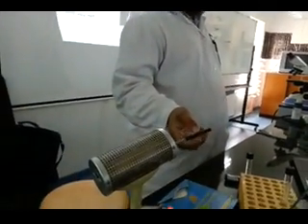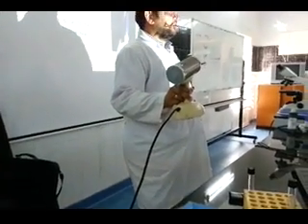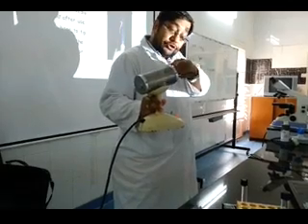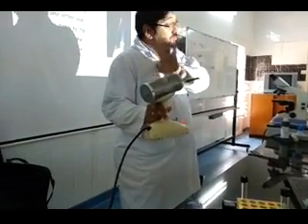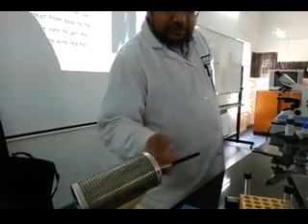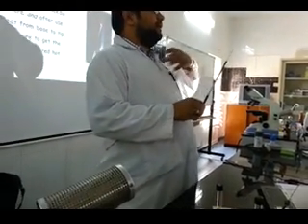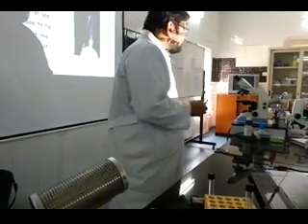Sterilization: you just put the loop inside here. You wait 20-30 seconds, because it is very hot inside; it's written "caution hot." That is not the name. It just means it's very hot, do not touch. You just put it in there and when you take it out, you'll see it's red hot. You see that? So that means it has sterilized all the bacteria and this loop is now sterile.